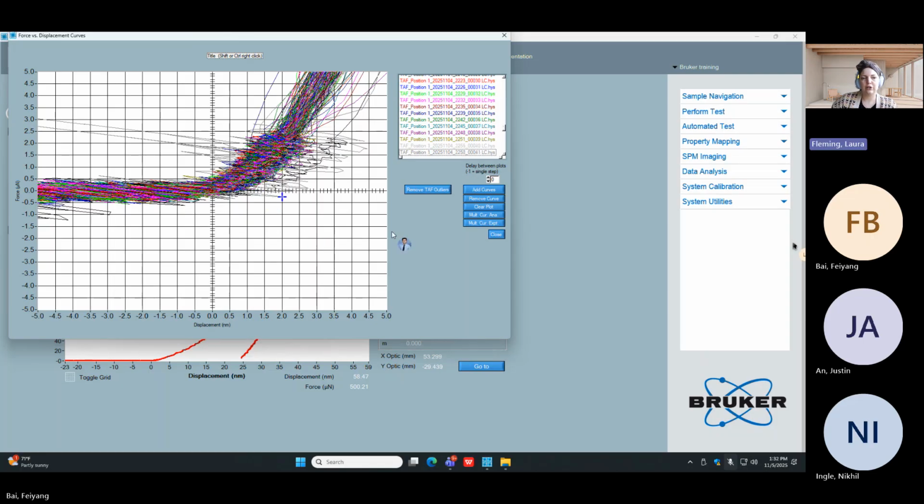Okay, so now that looks a lot more like a 0, 0 point for all of the curves combined to me. You can see how they all begin to actually increase in force at about this point. And here the force is now 0. So it used to do this, and now we are here. So this looks a lot better to me. So that's step 1 for getting your tip area function, or for any data. Any data needs to be re-zeroed. Are there any questions about the re-zeroing?